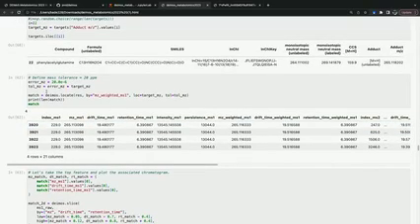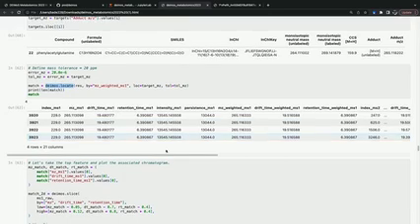Then you can use this DEIMoS locate function to look at our, in this case, deconvolved MS1, MS2 data. We're going to search for that feature in the MS1 by that target m/z and only search within that search radius of 20 ppm.